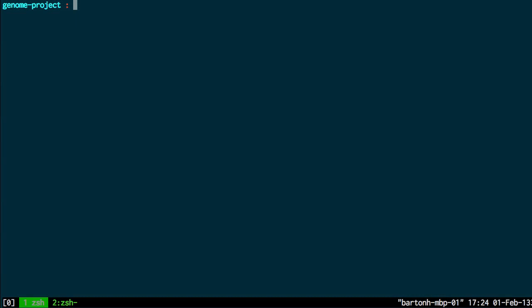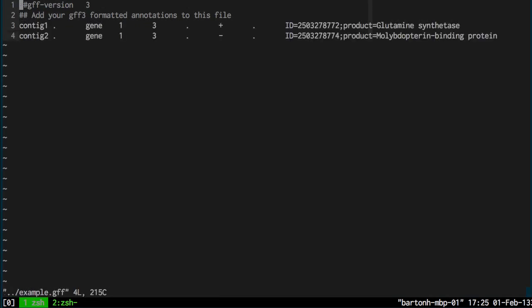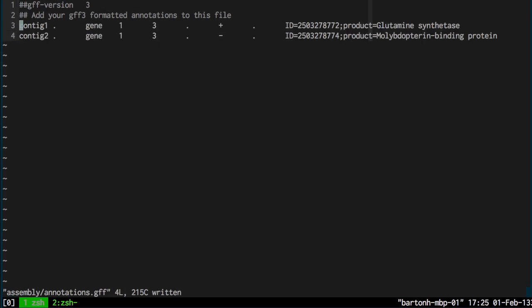And now say I wish to add some annotations to the scaffold. So I want to add some GFF3 format annotations to the assembly annotations file. So this is an empty file here. I've got some example ones I created earlier.